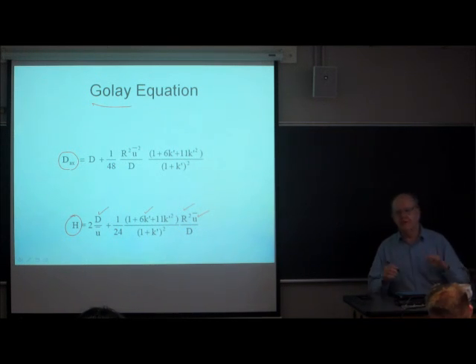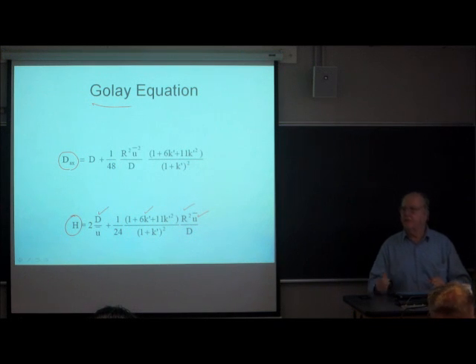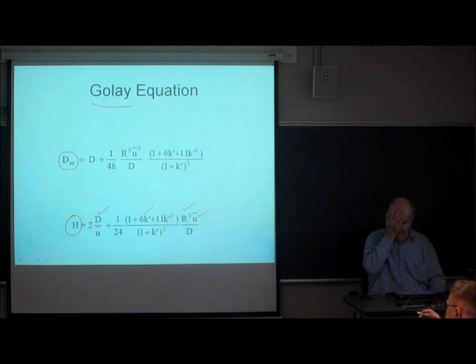You can predict the magnitude of the HETP without fitting any data, once you know the diffusion coefficient, the velocity, the retention factor, and the radius of the capillary. So this is what we're trying to get to. But to get here, we have to understand the physics of the flow inside the tube. So that's what we'll start to get into on Friday.